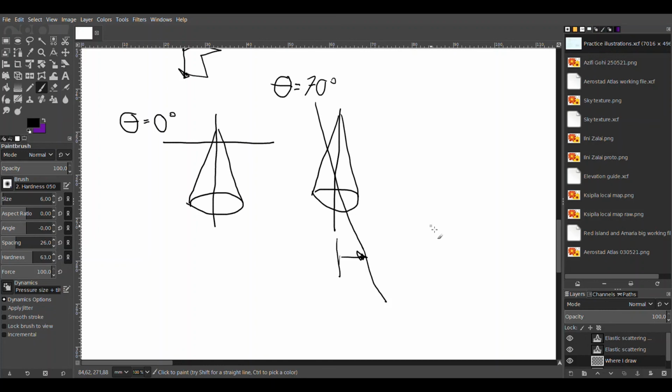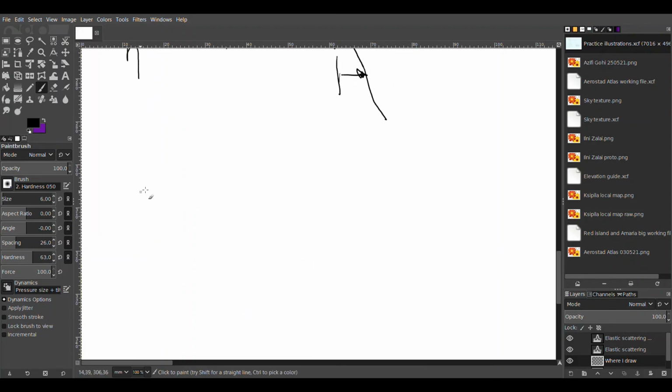I should take a break because of my voice. So the eta is greater here than it is here, because it's easier for the electron to get out here than it is to get out there. So therefore, a high coefficient of electrons getting out. There is a formula for this.